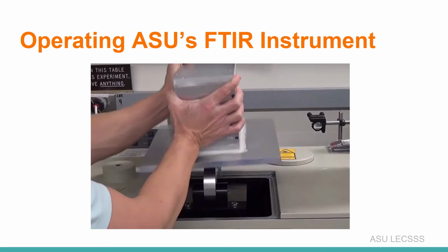So then you vent the system by simply pushing that down arrow button followed by enter. Also make sure to not touch the beam splitter when you're looking at it. Once the system is vented, you may proceed to make sure it's under the diamond ATR module. Once this is all set up, you can lift the metal lid straight, and I do mean straight up, without knocking or budging anything over.